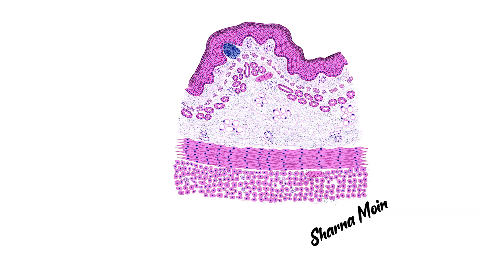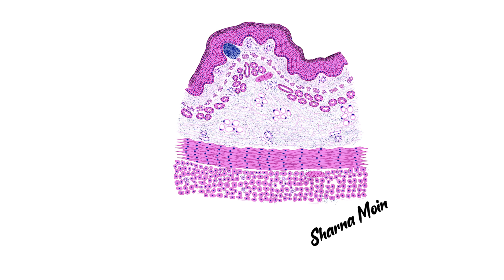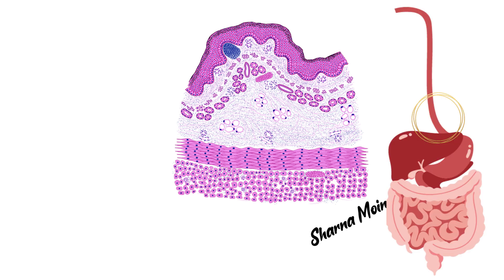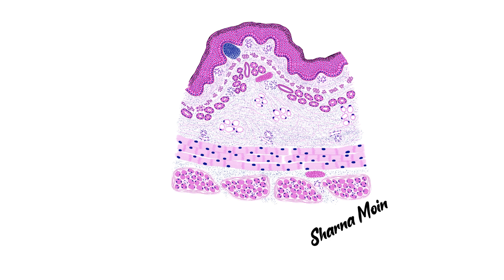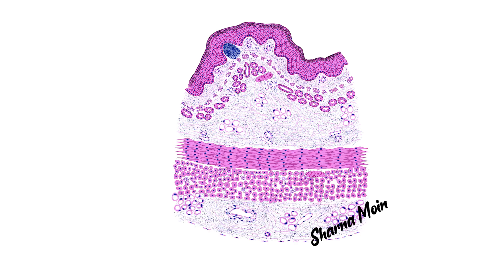In the next picture, both the inner circular and outer longitudinal layers exhibit only smooth muscles, so this section is from the lower third of the esophagus. Between the inner circular and outer longitudinal muscle layers you can see a special nerve plexus known as the myenteric plexus, which innervates the muscle layers and helps in peristalsis. This layer also has blood and lymph vessels.